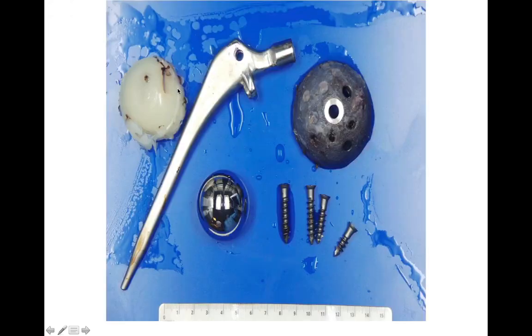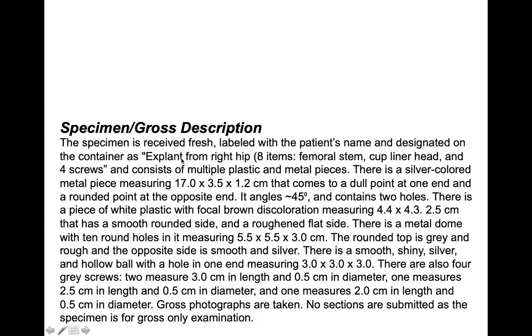More hardware. This looks like orthopedic hardware again. You would look at this, you would describe it, and then you would sign this out. So this was described by a lot of words. There's a lot of words here.